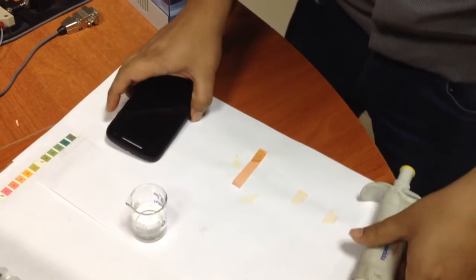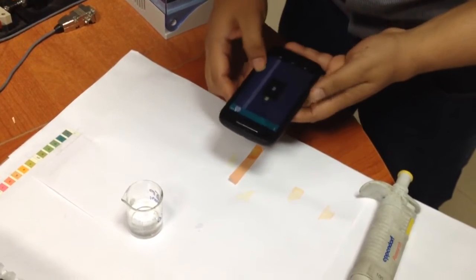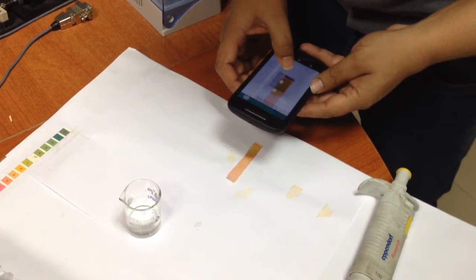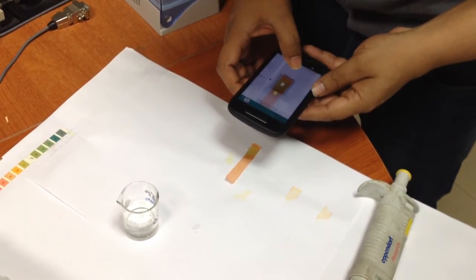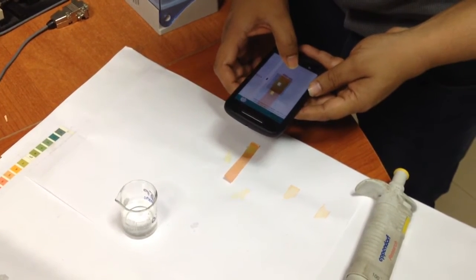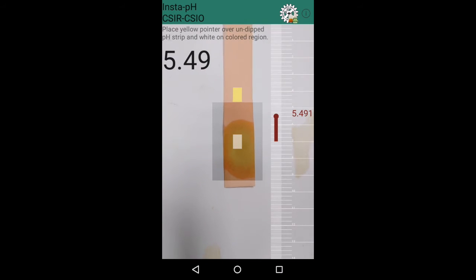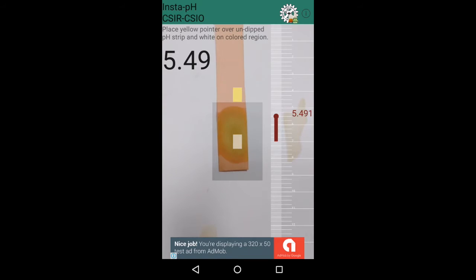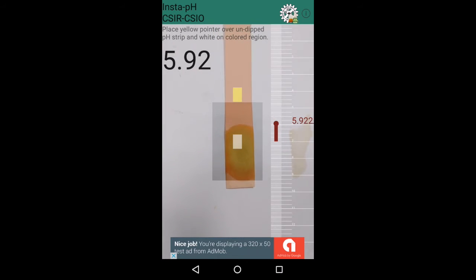We have developed an Android-based application for smartphones, which reads the color of the pH strip from the camera and predicts the value of the pH. The user just has to click the picture of the pH strip and the application predicts the pH value. The present available systems in the market cost in the range of rupees 600 to 50,000.